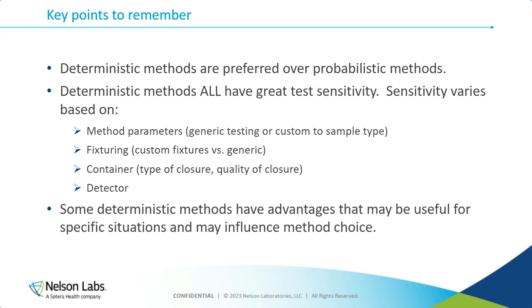If you have a really good capping process and you make very consistent caps every time, you could probably fine-tune that method a little bit more. Most of the time, though, we see that there's a bit more variance in the final flow values, meaning that the quality of the closure has a little bit more of a fudge factor to it, and so you need to make sure that in those cases the method is going to probably be a little bit less sensitive and a little bit longer to accommodate for that.